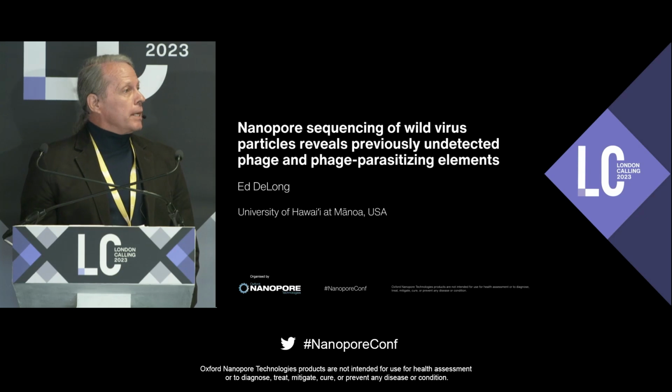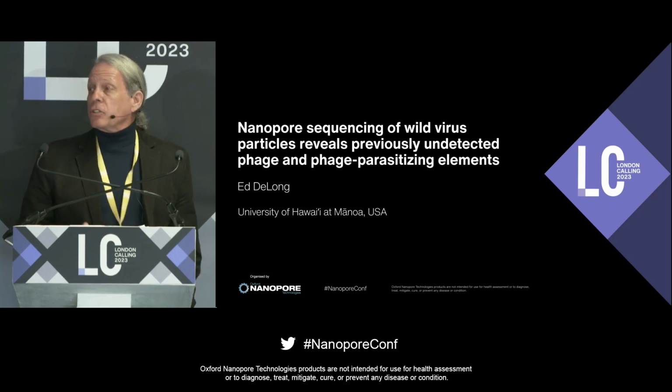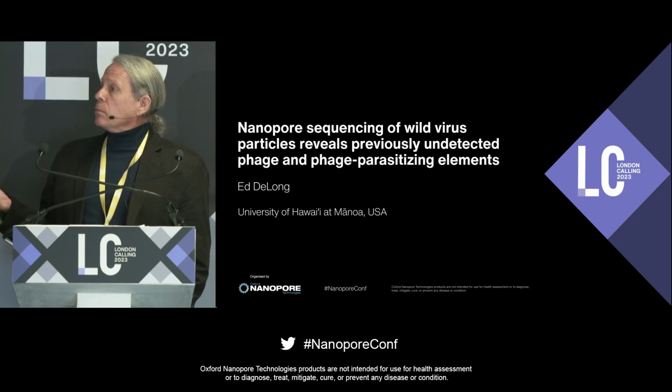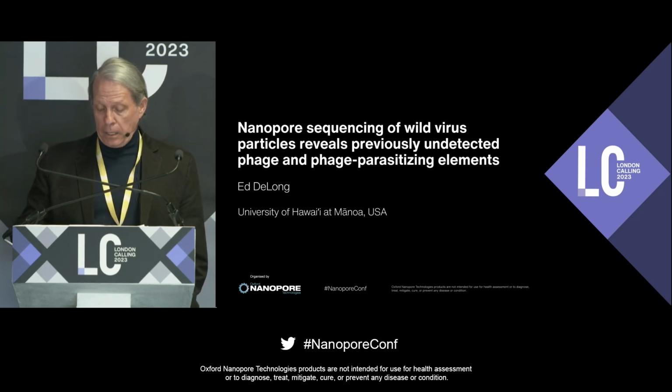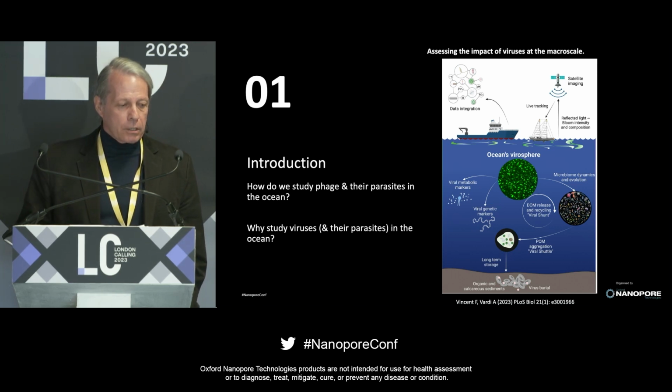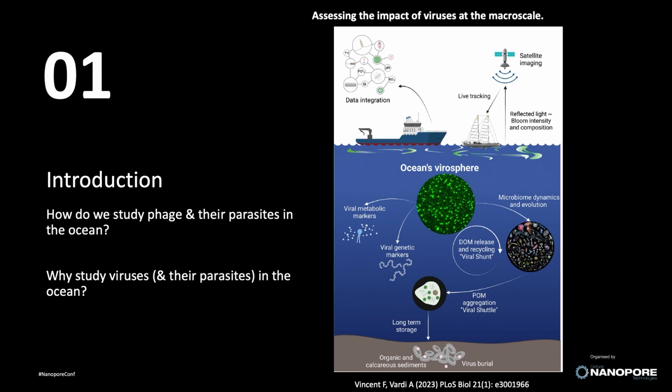So I'd like to talk about some discoveries we've made just by applying nanopore sequencing directly to sequencing phage genomes from phage collected in the environment. So we can ask a couple basic questions first. Why study viruses and how do we study them?